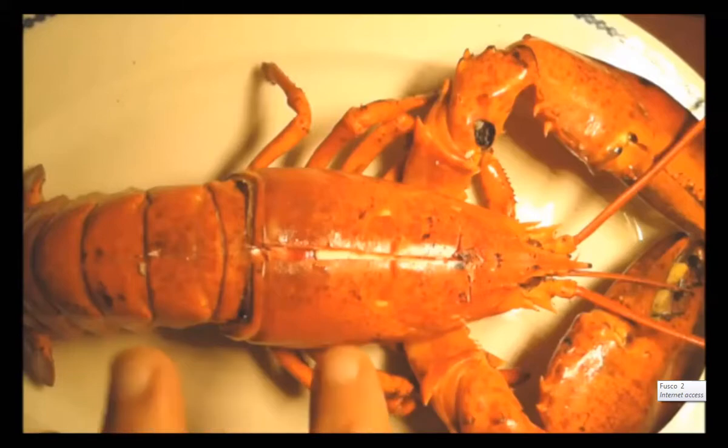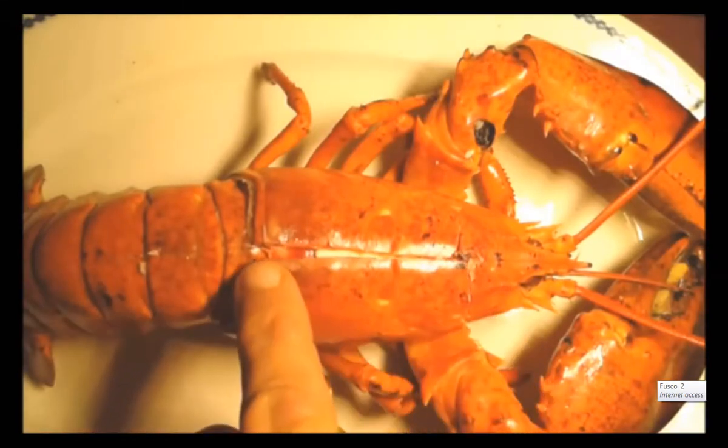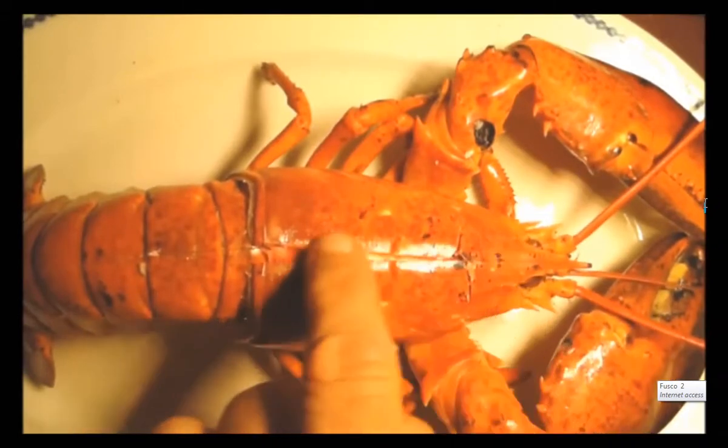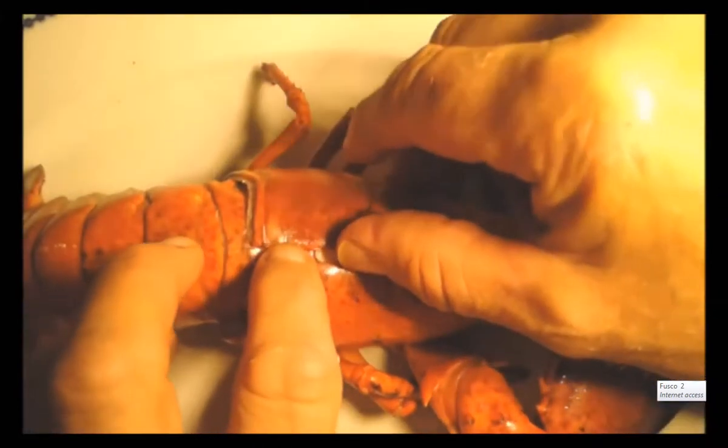I've taken the liberty of making an incision along the dorsal side of the lobster from just behind the rostrum all the way down the length of the body, and I'm going to open him up.